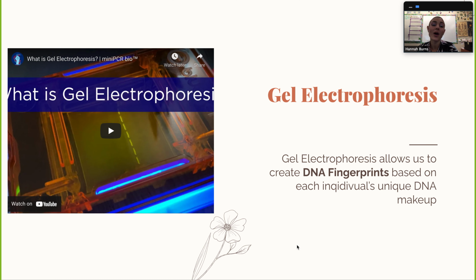We are going to be walking through the process of gel electrophoresis. So you'll be watching through this video, and then we will be actually using some of the different instruments that we see in this video to get comfortable with using what's known as a micropipette. And then next week, we will be doing gel electrophoresis in class to look at the different DNA patterns that are created based off of the different DNA makeup of each individual.